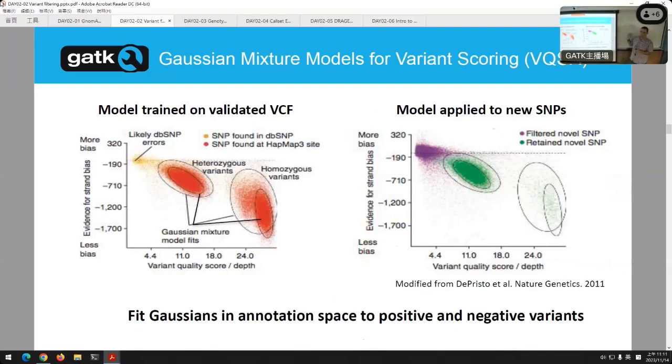Okay, that was a side point. But the important point here is that we need to set those thresholds between what are clearly bad and clearly good, and they kind of bleed in. Sometimes it's hard to see that dividing line.